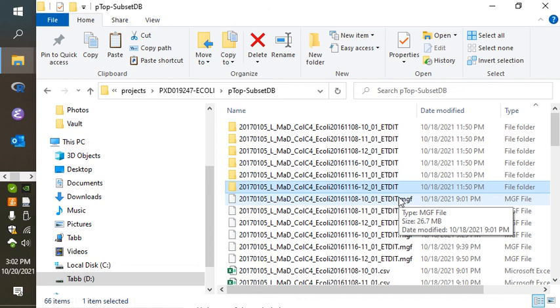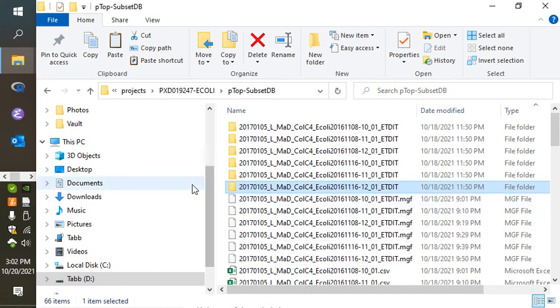You could set it up to run through some of the more time-consuming pipelines, but I think that pTop actually does a really good job of giving you quick results that are easy to interpret and easy to configure and launch the search. And even better, it's totally free. I can hardly turn down a piece of software that I don't have to pay for. So I hope that's been useful to you, and good luck with your top-down data analysis.